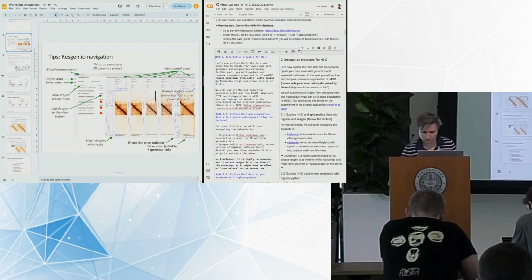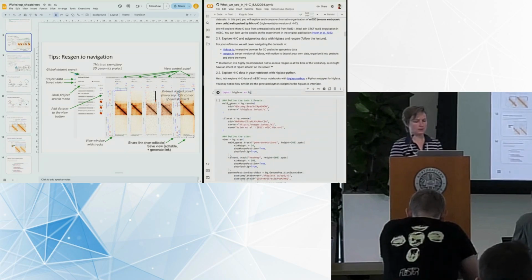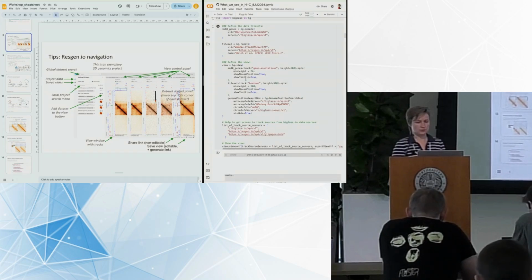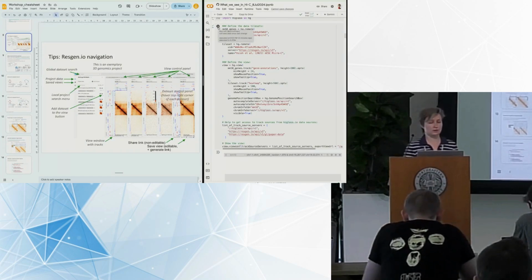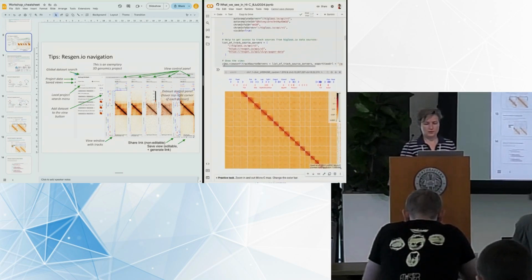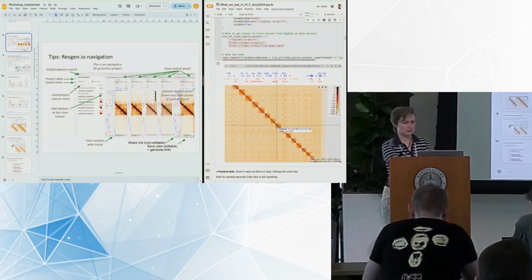And then you can start executing the code. Ideally, import HiGlass should work perfectly with no warnings. And then you run the next cell. Basically, you can press this button, play the cell, or you can type Shift-Enter, and it will be doing exactly the same. What you will see now in your Google Colab will be this nice HiGlass view.